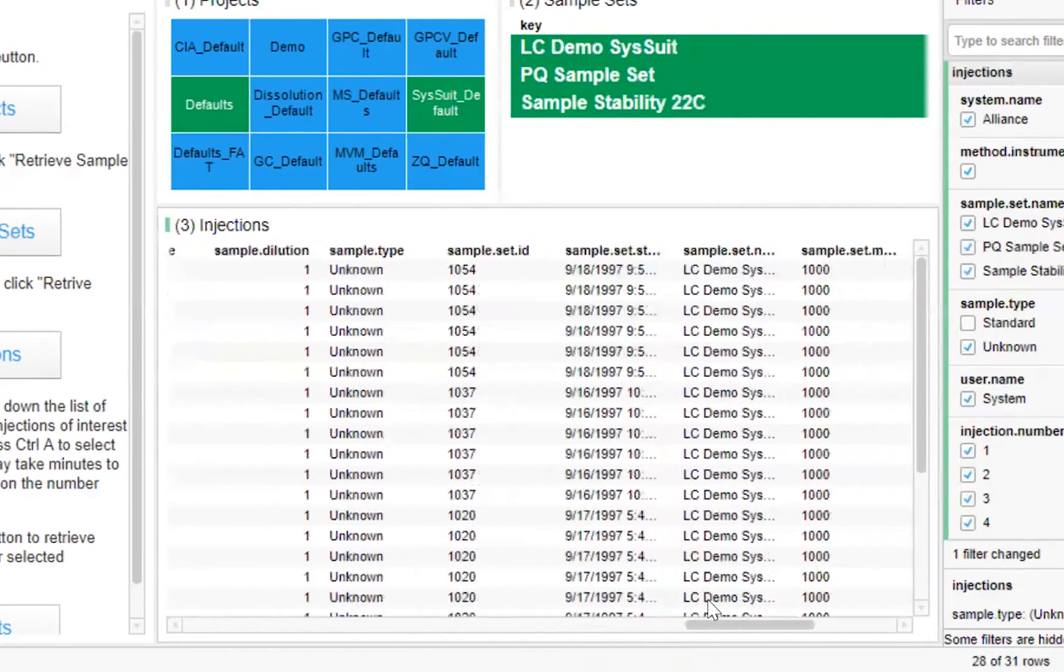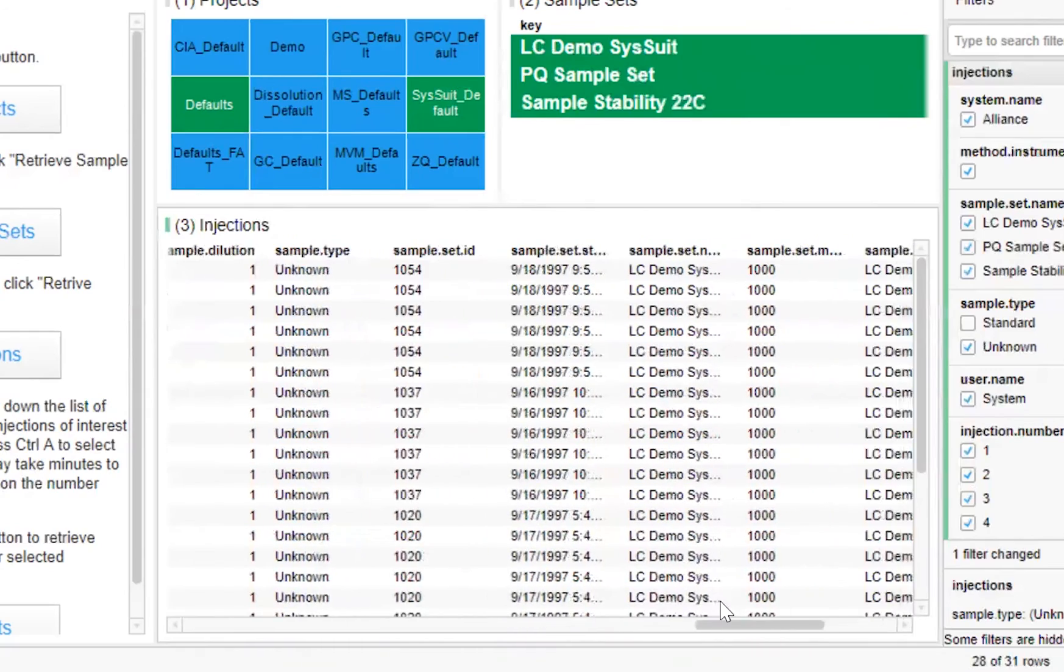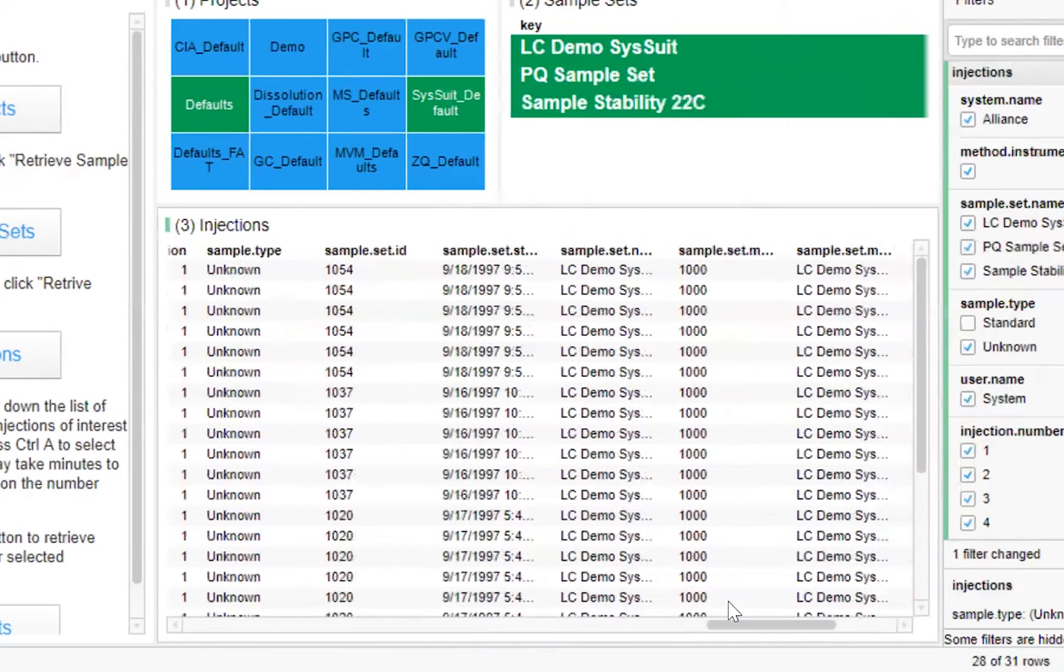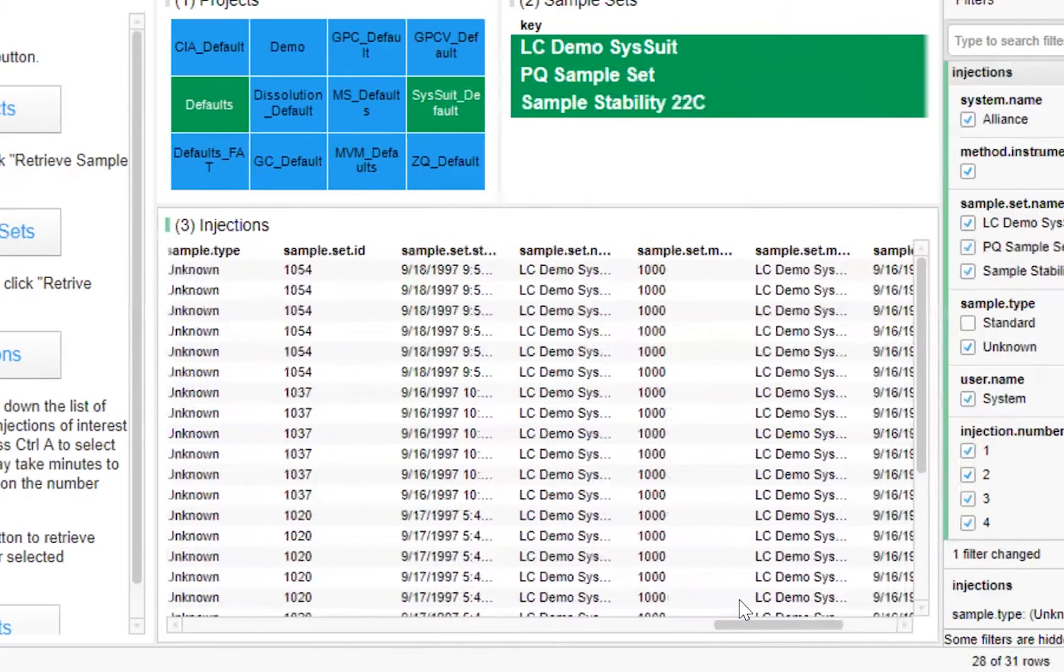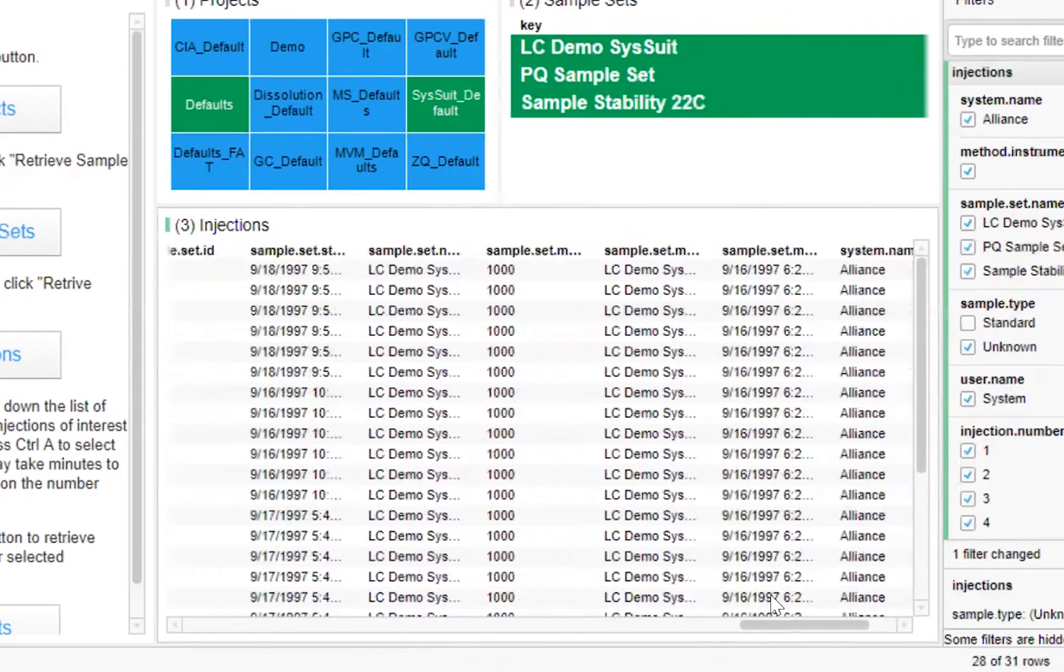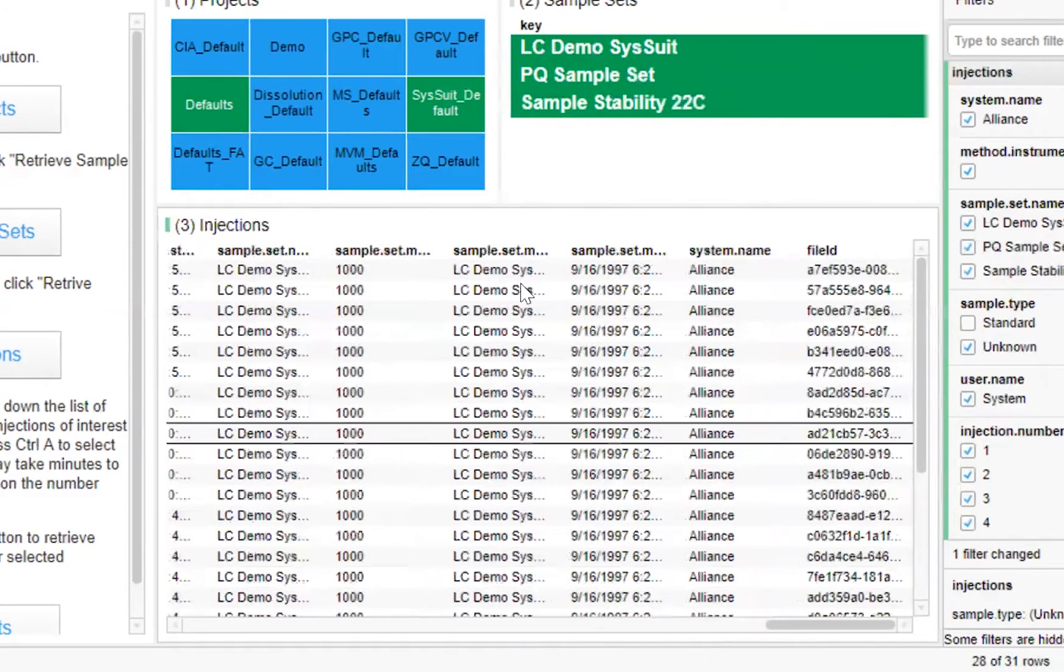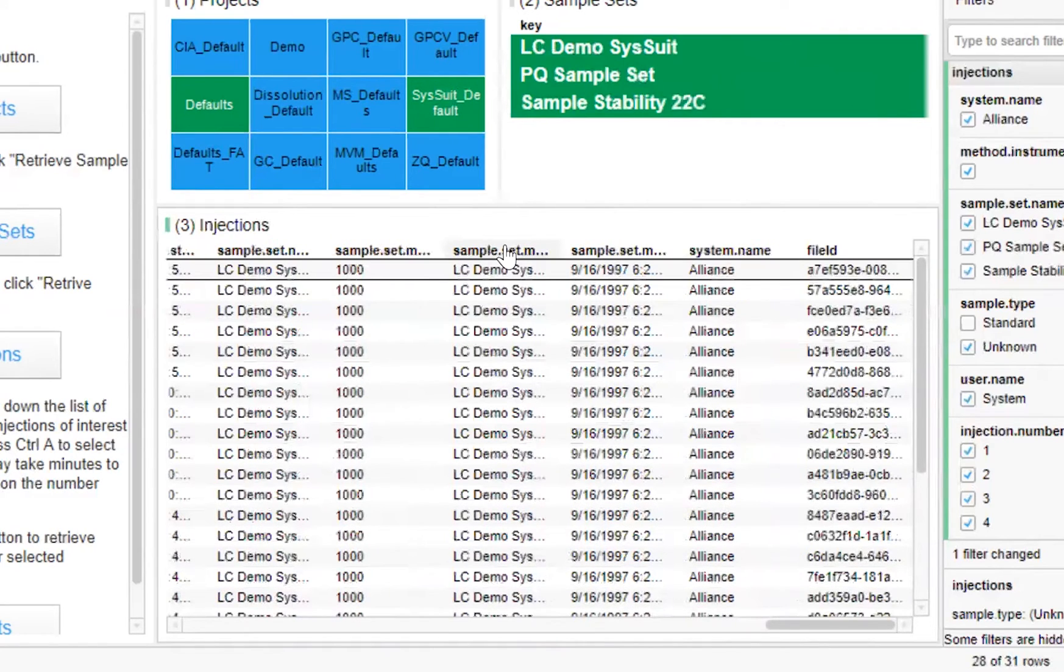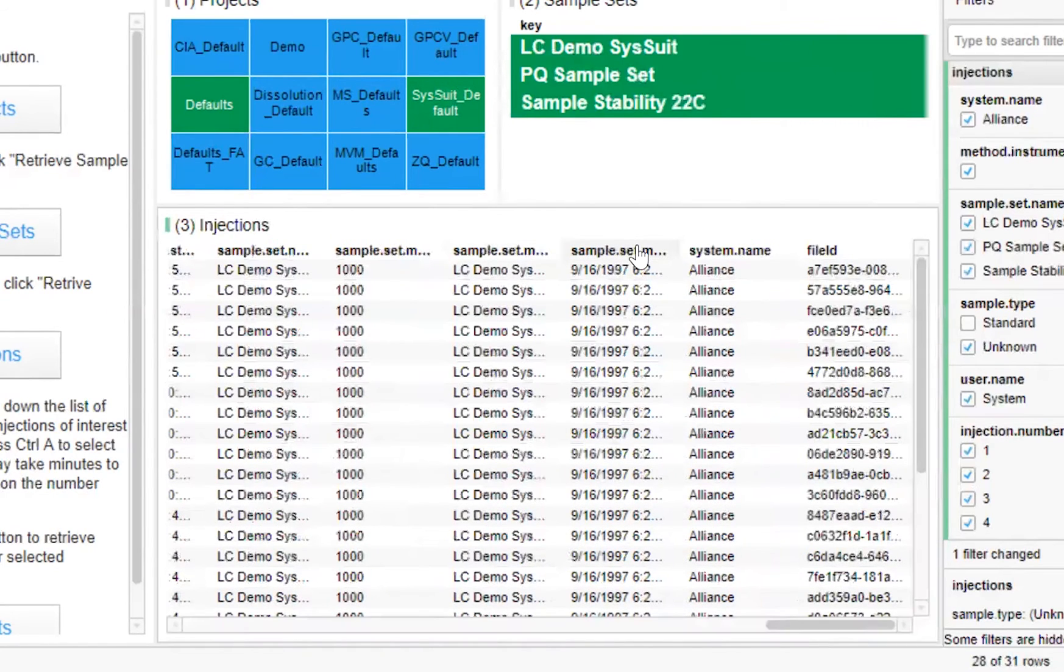We can see which system was used, when the method was run, and a number of other useful metadata fields, which can all be used to support complex visualizations and analyses.